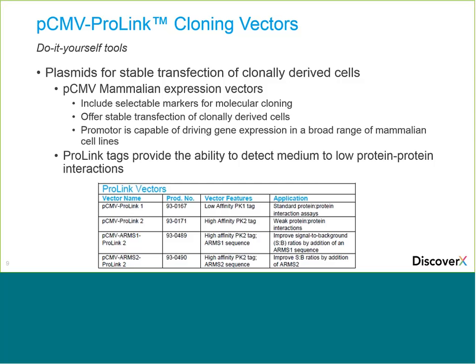You could do this the opposite way. You could introduce your plasmid and then do the retroparticle selection. But this may not be preferable. To do it as we've indicated here may be more desirable, because maybe you want to look at multiple comparisons, different GPCRs with different mutations, for instance, looking at different scenarios, basically, in different model systems. So this is the advised pathway to follow.